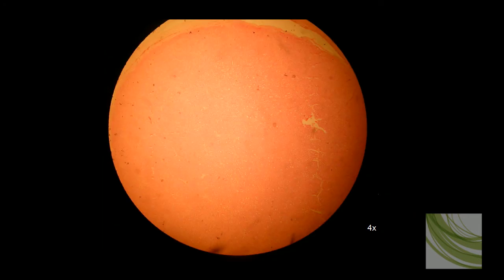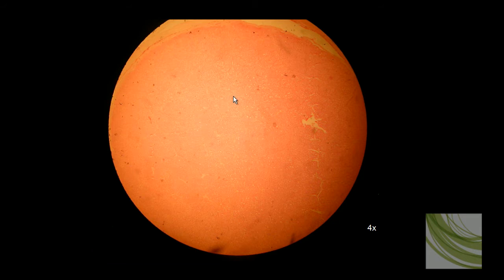This next slide is not nearly as good as the previous slide, but it's one we have here at the school and you might actually pick it up and look at it, so I wanted to give you a quick rundown and show you what we can find. Here is the slide at 4x and we can see the little tiny white dots — those are the places you would find the myelinated axons within this cross section.